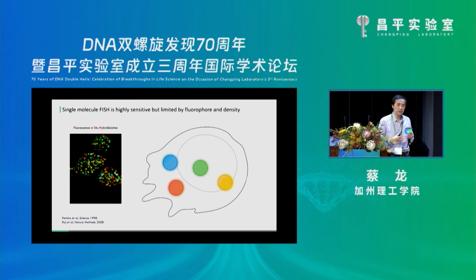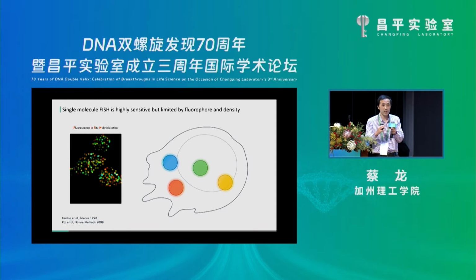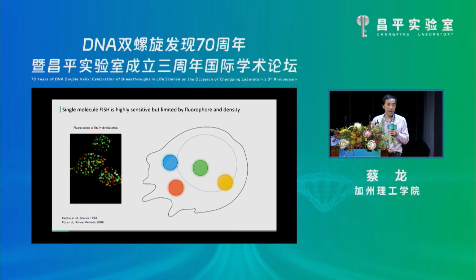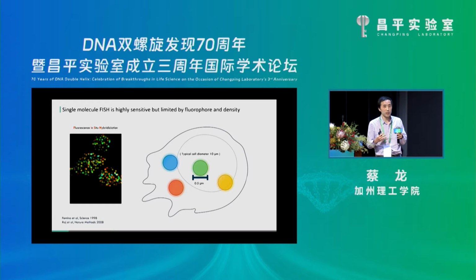And that's a problem with using optical microscopy to multiplex a large number of genes, in that each one of these dots occupies a couple hundred nanometers in space, and the cell is only a few microns in space. So you can't really jam as many dots as you like in a cell. So we actually started working on this in this field by using super resolution microscopy to shrink the size of the dots and then allow us to pack more of the dots in.